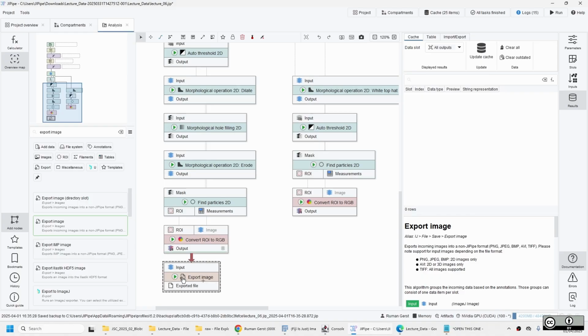So when you add this in, it absolutely runs. It will export them actually, but to somewhere with an automatically generated name. That's not what we want. We want them somewhere in the specific.